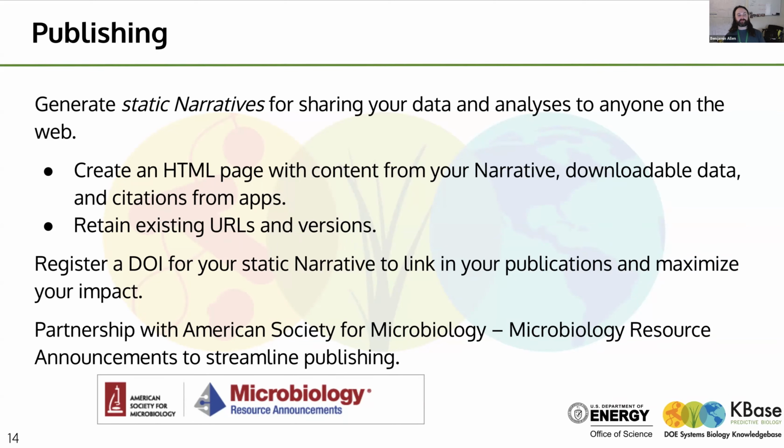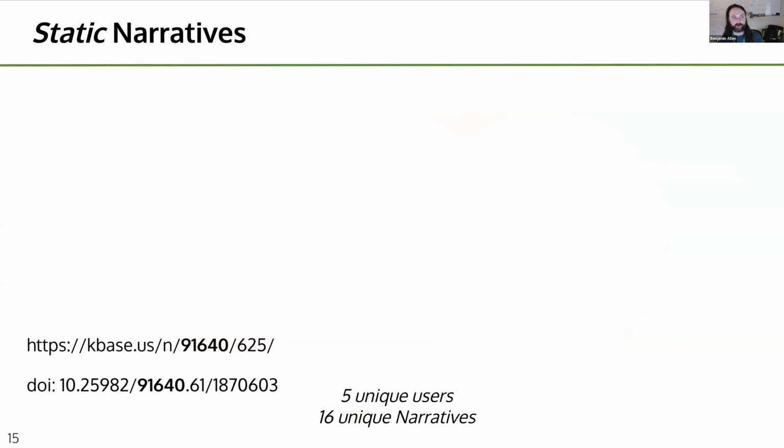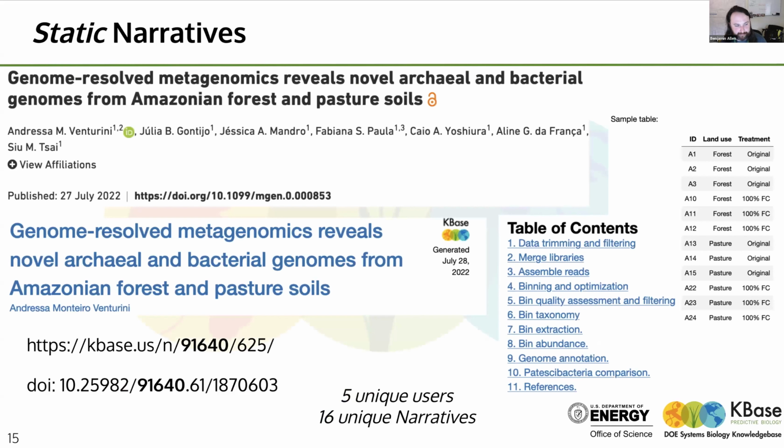And so we've partnered with ASM Microbiology Resource Announcements to build a collection of MRA announcements that are linked to these static narratives with DOIs as well. So just additional layers of promoting the work that you've generated on the platform. And this is just an example that we have from some users that have generated some MAGs from the Amazonian forest.